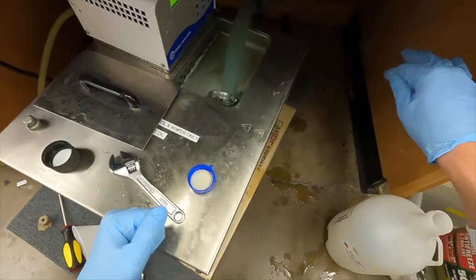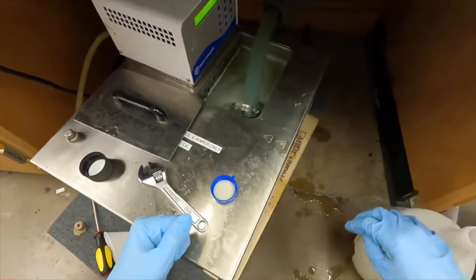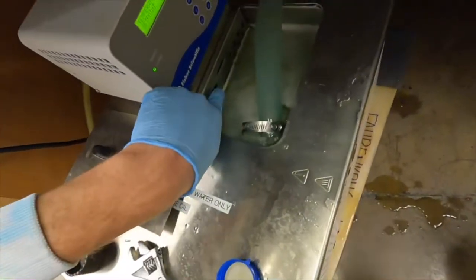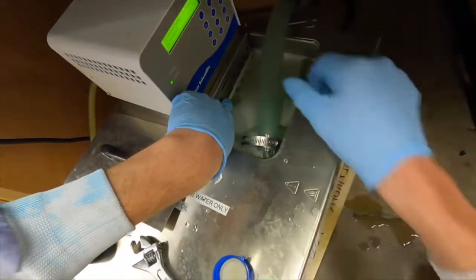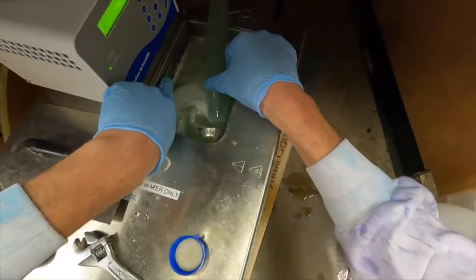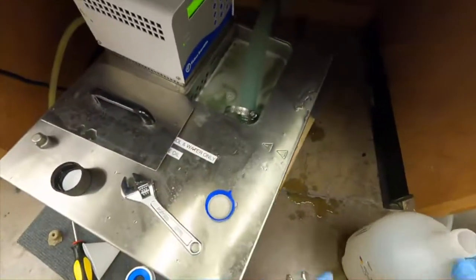Usually we turn this on a couple hours before we start. These are the lines I was talking about. This is the low line - right now this is too low, we need to add more fluid - and this would be the maximum fill line.